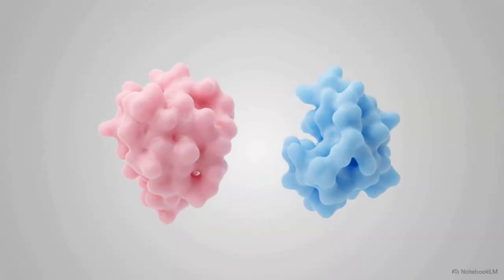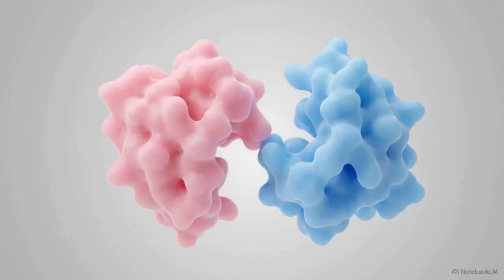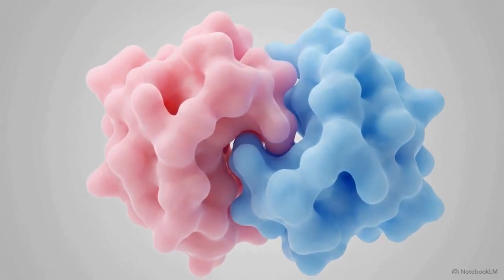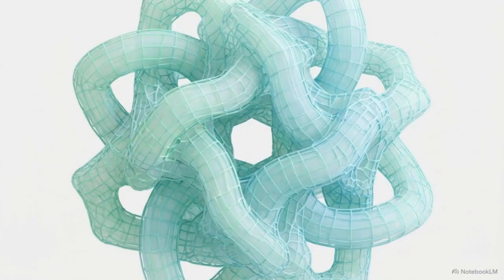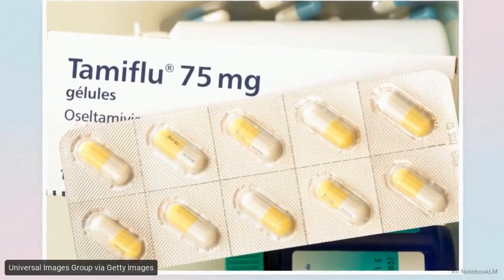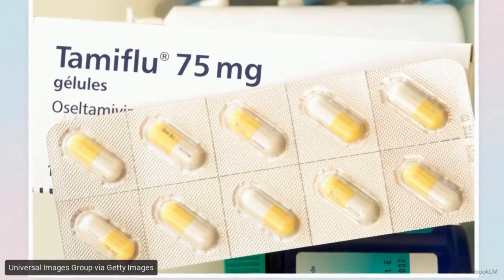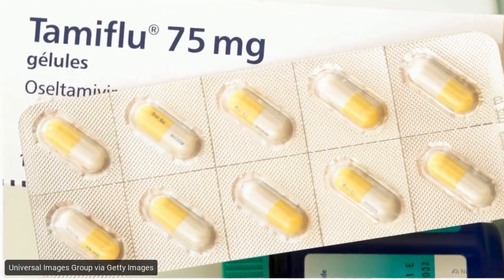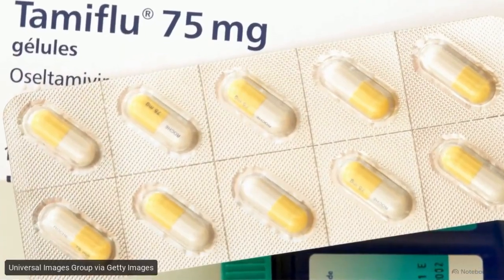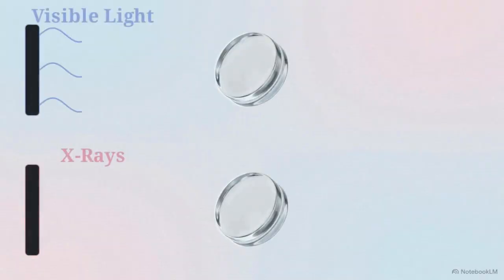Most biological functions are defined by interlocking molecular shapes. To design a life-saving drug, we first have to understand the specific three-dimensional geometry of the target protein. Many effective antiviral medications, like Tamiflu, were developed only after researchers successfully mapped out the physical structure of the proteins they needed to block. But mapping those atoms is a physical challenge.